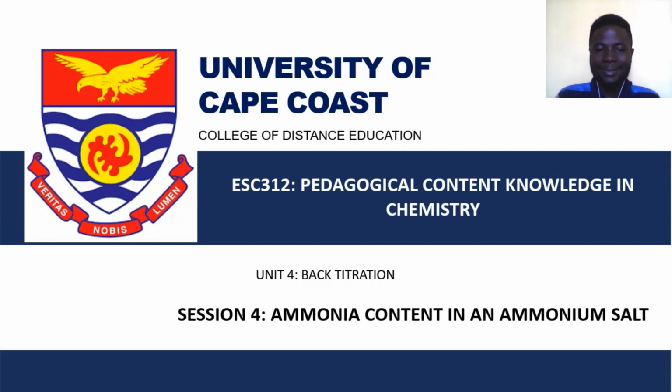Welcome to session 4 of Unit 4. In this session, we are going to determine the ammonia contents in an ammonium salt.